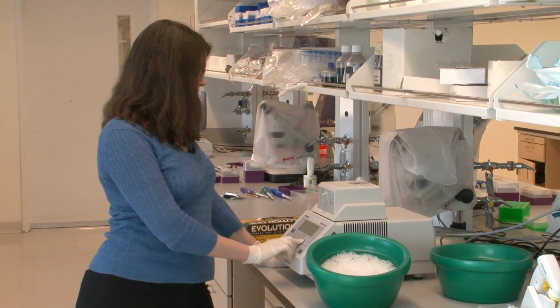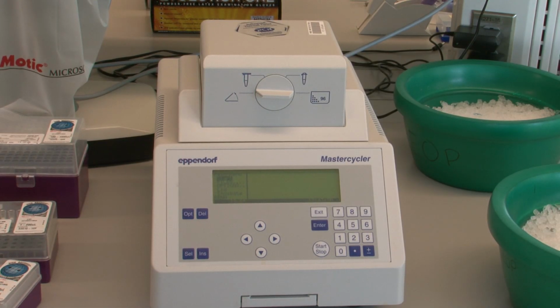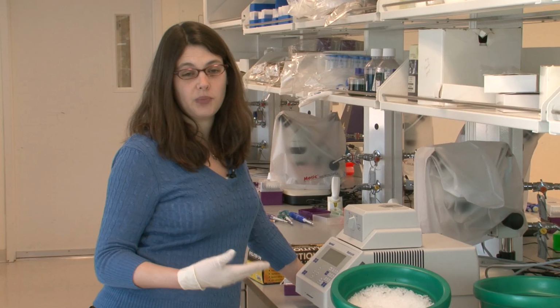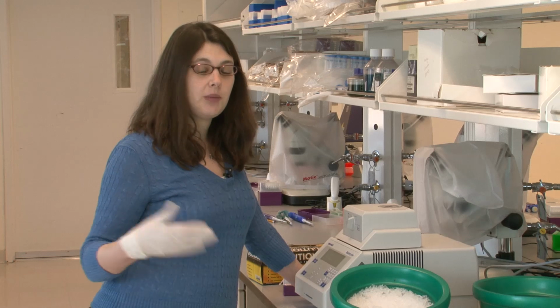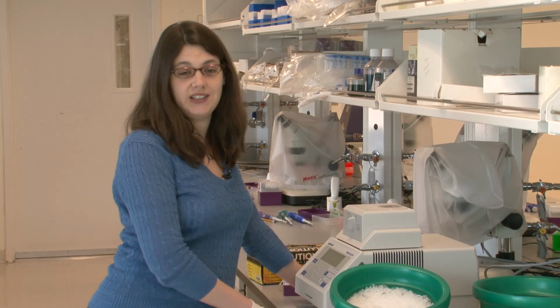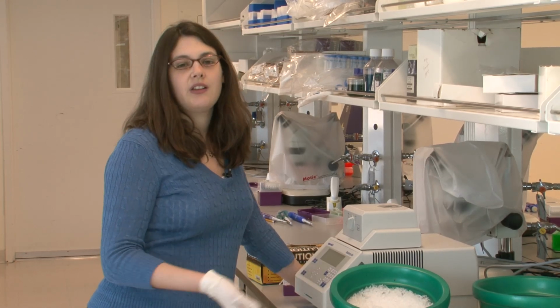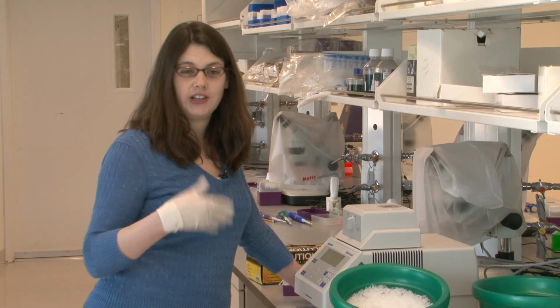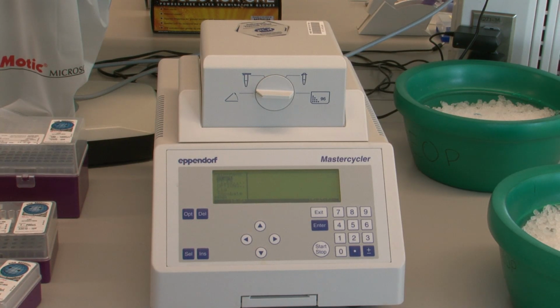What the program is actually going to do is that this machine, although it's called a PCR machine, all it really is, is a heating block. This machine is a heat block that changes temperature really rapidly. So it's going to change temperatures, and each step of the copying reaction happens at a different ideal temperature. So as it changes the temperatures, then the steps of the copying reaction can occur in the order in which you want them to.